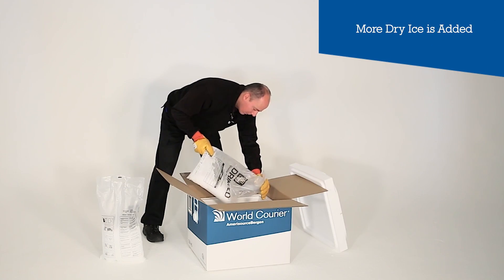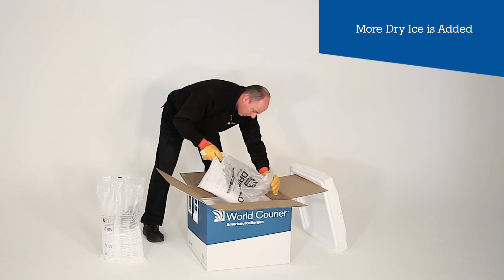The box should be totally filled with dry ice for best performance. The more air, the weaker the performance.